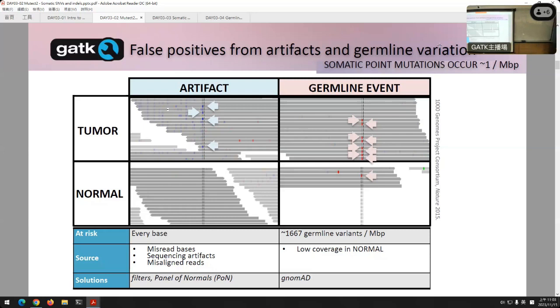All right. And by the way, that happens sometimes if there's limited funding and people want to focus their sequencing. They'll focus a lot of it on getting really high depth on the somatic cells and maybe a relatively low pass on the normal. But it does introduce this class of error where you don't have enough depth to be able to call it in the normal cells, but you can on the somatic cells. Then you can make the mistake of assuming it's only there in the somatic cells if you're not careful.